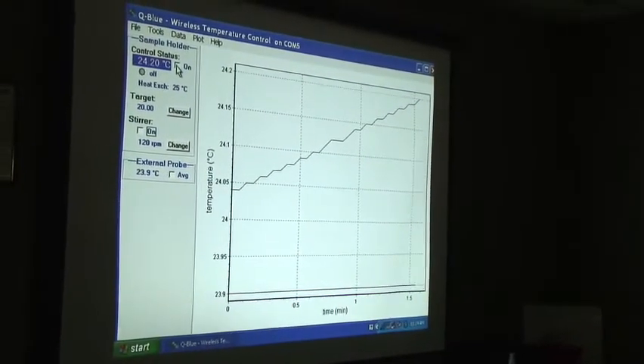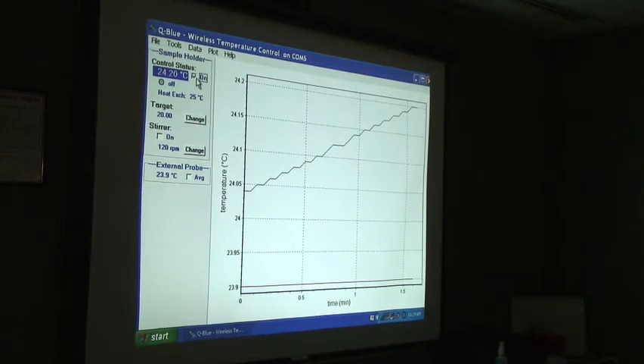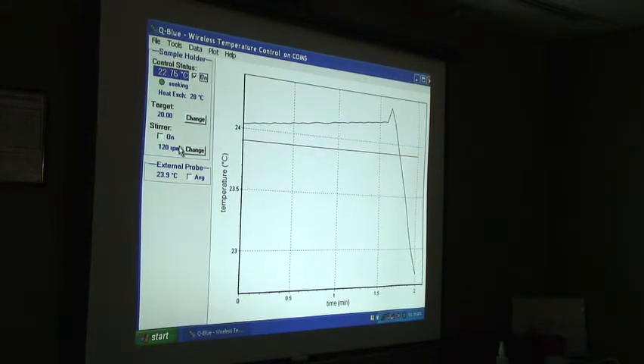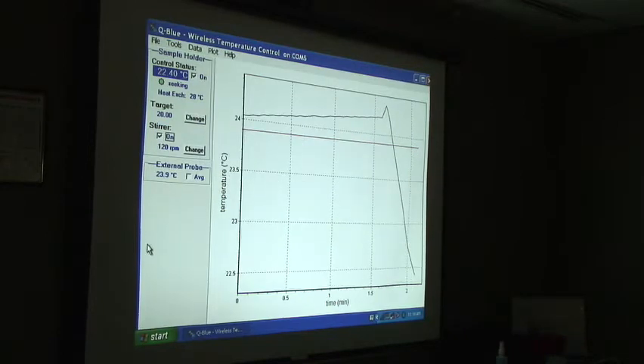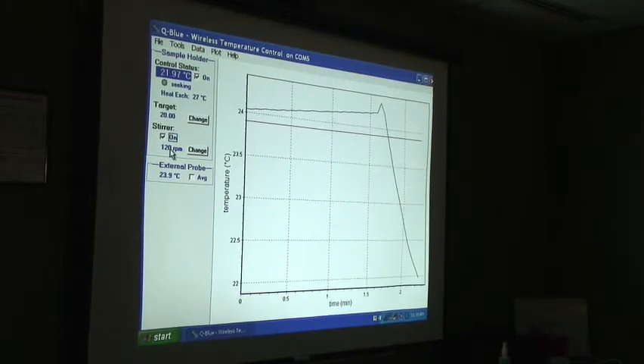Let's turn on the temperature controller and set it to a target temperature of 20 degrees. It is now seeking — it's going down to 20 degrees. I think we should turn on the stirrer, so I'll click on. And now if you looked in there, you'd see the little magnetic stirrer going around at 120 RPM.